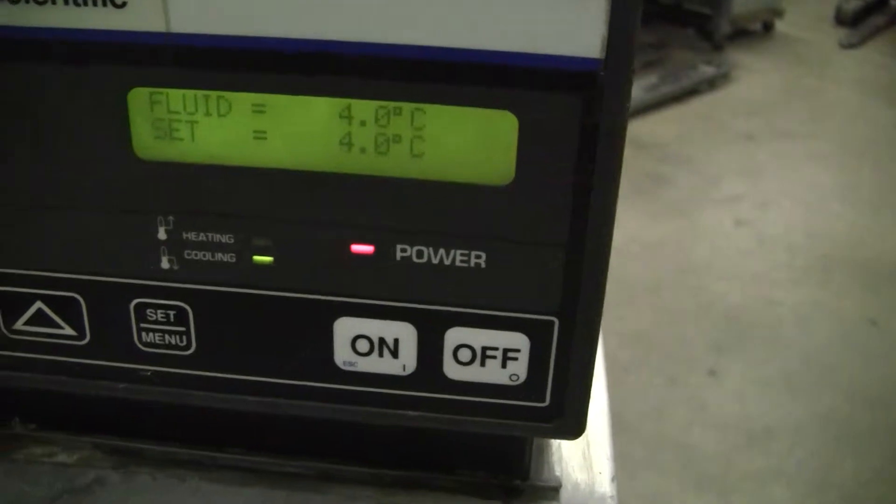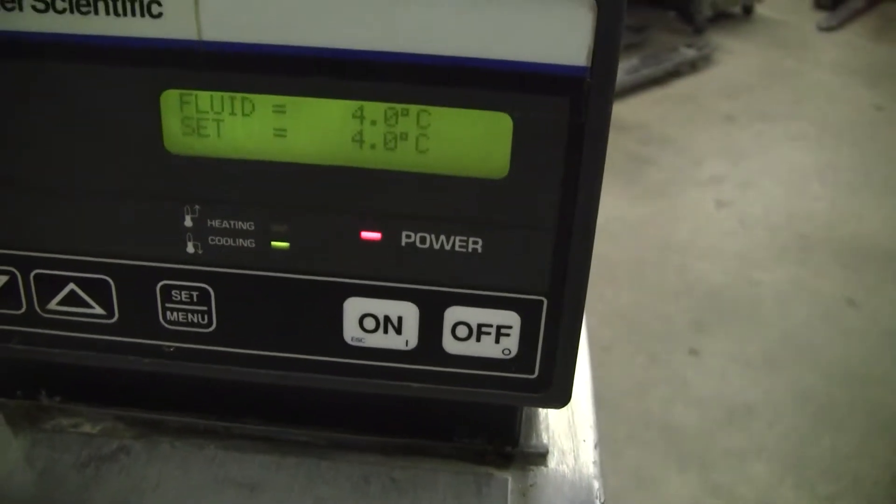We currently have it set at 4 degrees C. It's been holding for about 20 minutes or so. You can see it toggling.